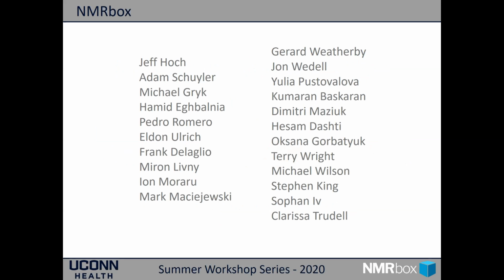And the NMRbox team is actually quite large. Here is a list of, I think I've got most of the NMRbox team here. A few names to really highlight: Jeff Hoch, obviously, is the PI. Adam Schuyler basically does all of our workshop coordination, in addition to helping generate the NMRbox platform.